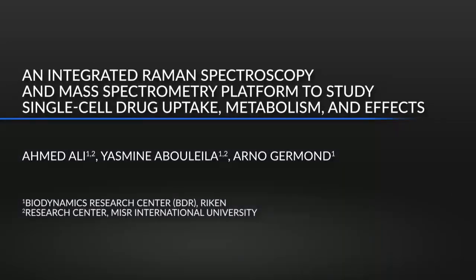We developed an innovative method for metabolomics. We combine label-free spectral imaging of living cells with single-cell mass spectrometry. Our technique can monitor and predict the metabolic changes of single cells against drugs. And this opens a lot of application for basic research and industry.